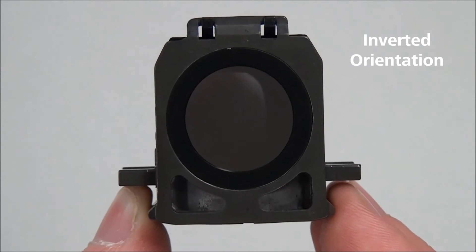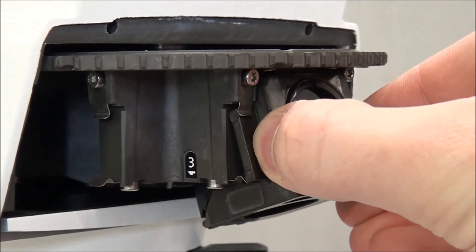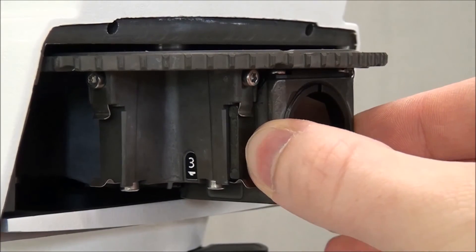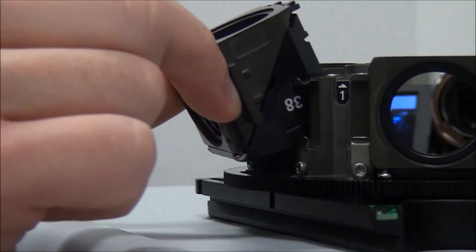On an upright microscope, insert the top edge first under the metal clips, and then tilt the lower edge into place until you hear a click. On inverted microscopes, start with the bottom edge and tilt in the top edge until you hear the click.